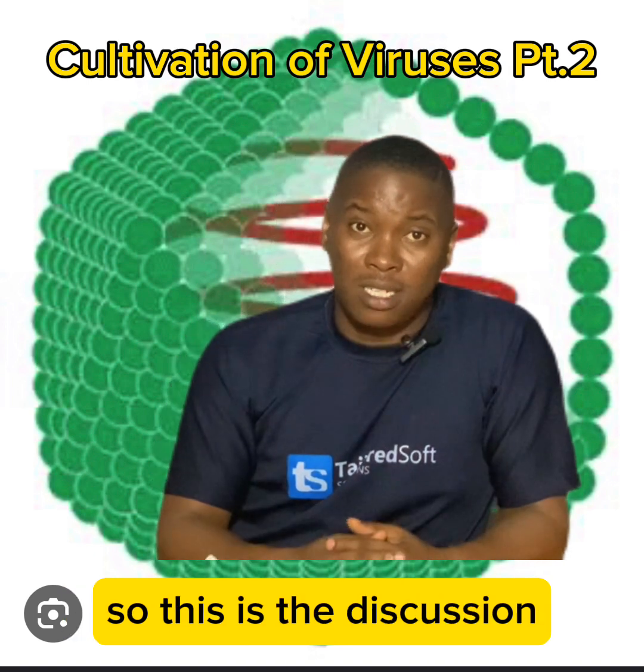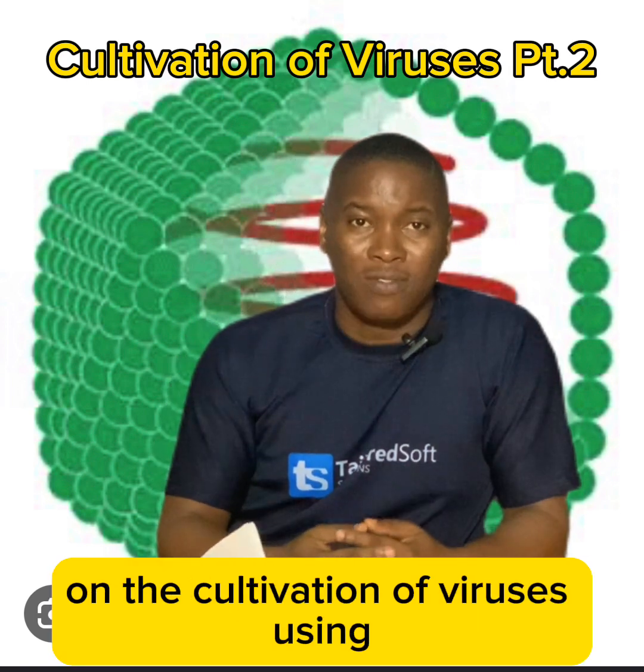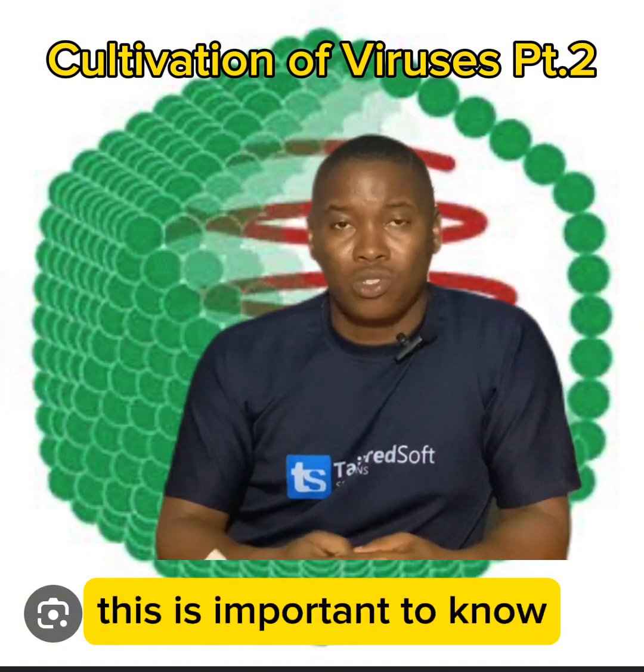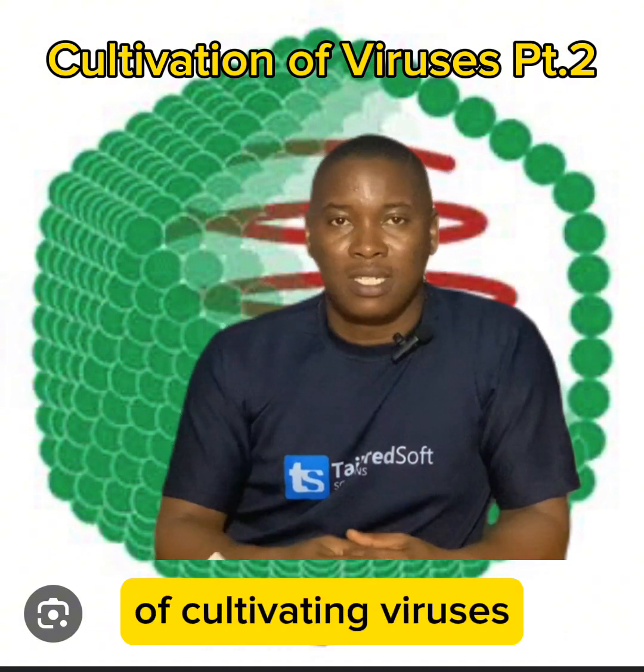So this is the discussion on the cultivation of viruses using embryonated eggs. This is important to know, and this is a method of cultivating viruses.